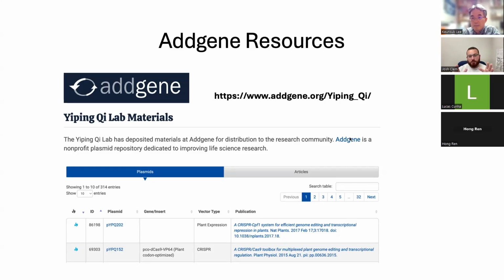So we can assess the editing efficiency at a particular target site in like 20 different plants, just as an example. You could do more or less. For about $55, we can get a lot of sequence information. I average typically around 10,000 reads of a particular amplicon per plant.